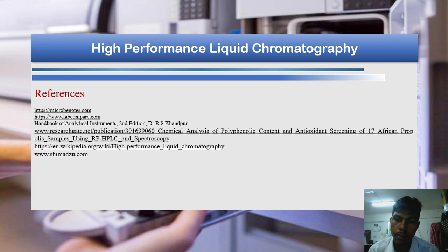Why did we choose this system? Because this system works with the liquid system, and especially in industries and other institutes, we have continuously used this liquid phase system, and it gives reproducible and rapid analysis, and reliable speed and efficiency.